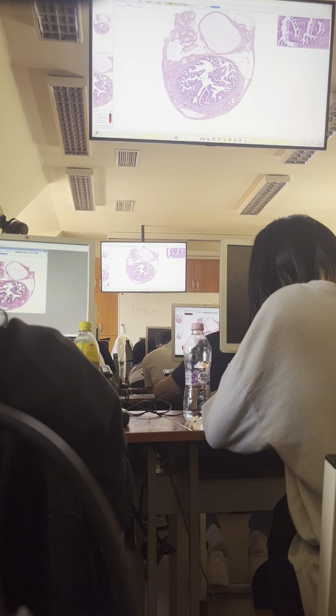But there are also darker cells which are non-ciliated, like this, or like that. These are secretory cells, produce mucoid substance. So these are the two kinds of cells.